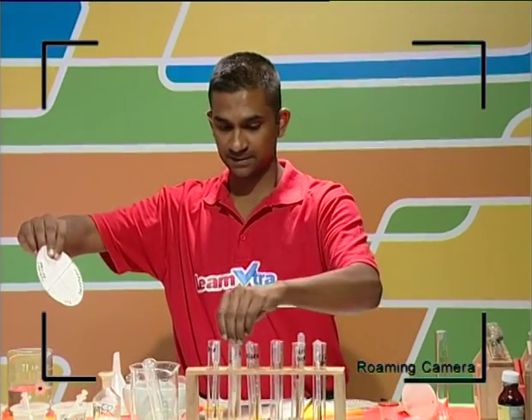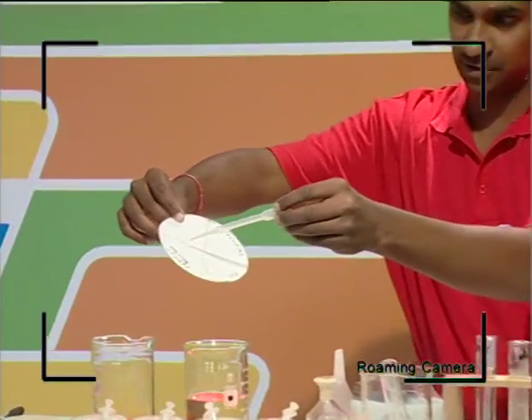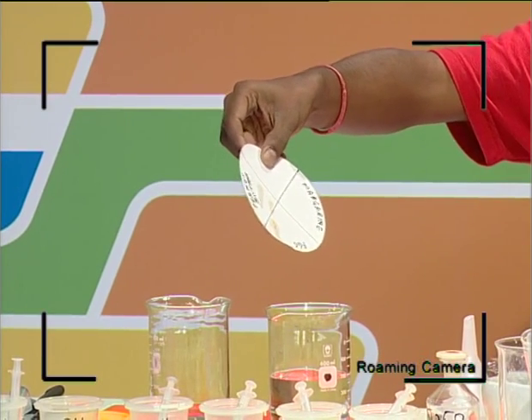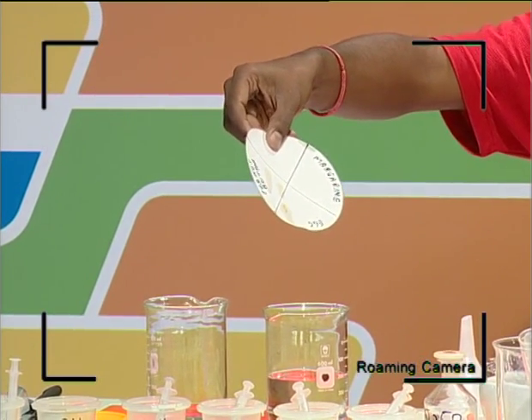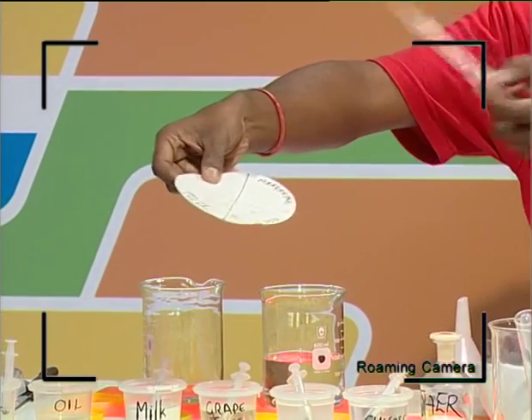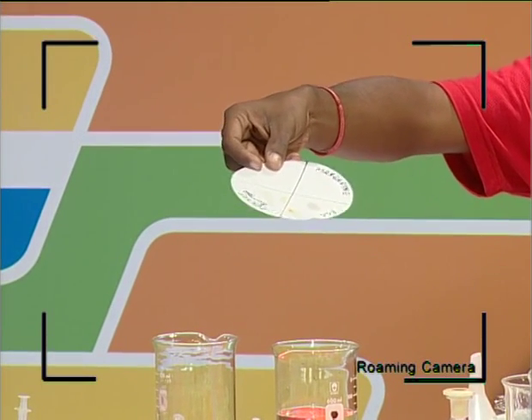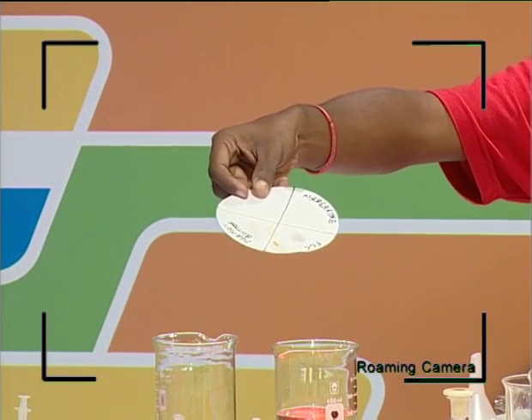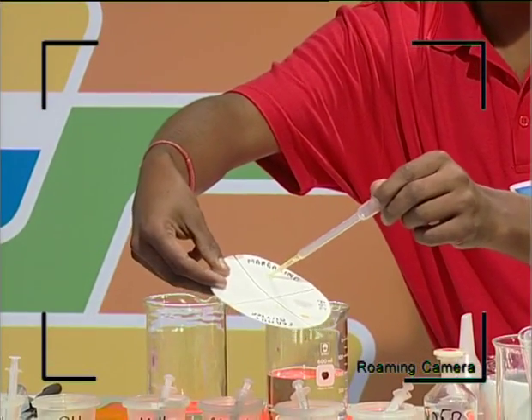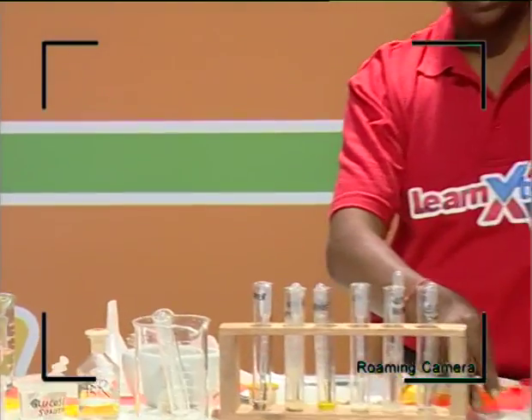So we've got peanut butter. Okay, so here's peanut butter, guys. Put a little drop in there. Oh, too many. We've got eggs. And remember that experiments don't always go as planned. And that's why a scientist will always repeat his experiments to get the best possible results. And that's part of doing an experiment. You can never get it right the first time, no matter how good you are at it. Okay, and here's margarine. And I'm going to put a drop of margarine on there. Okay, and I'm going to let this also evaporate and see what happens.